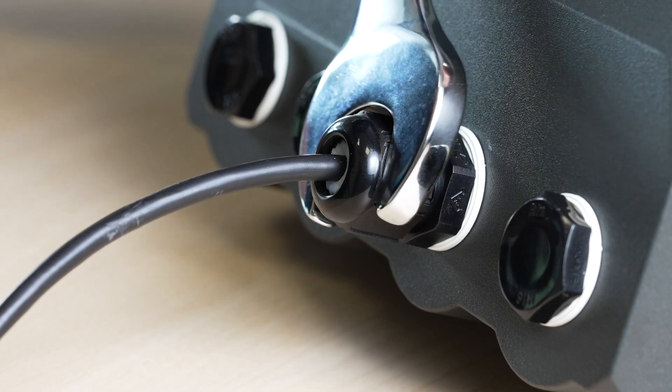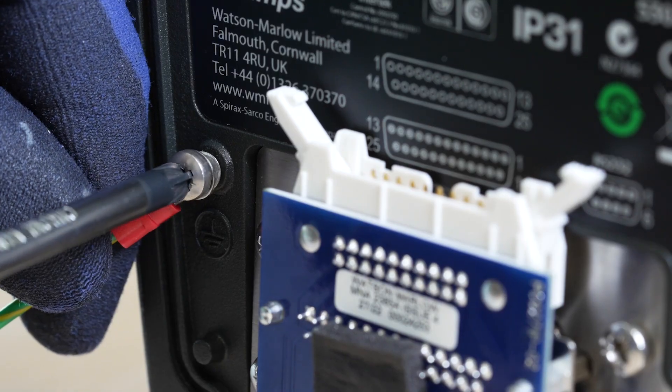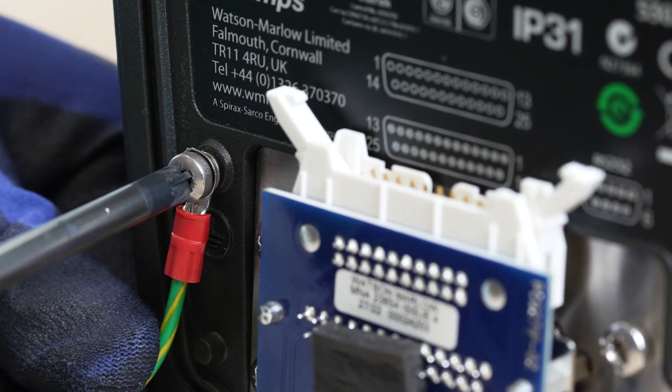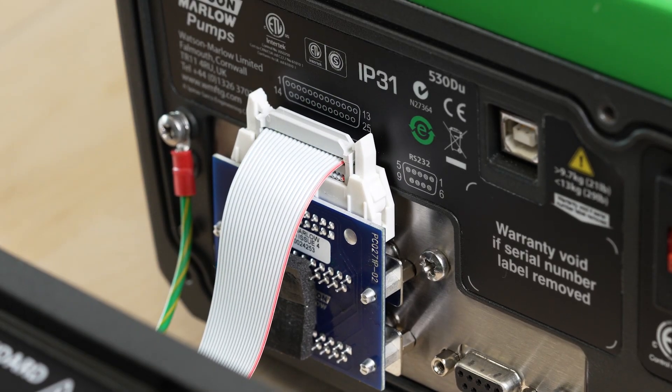Attach the cable screen to the earth spade terminal. Tighten up the cable gland to secure the cable in place and provide a waterproof seal. Replace the earth wire between the pump body and the I/O board. Following the keyway, reinsert the ribbon cable to the connector adapter board.